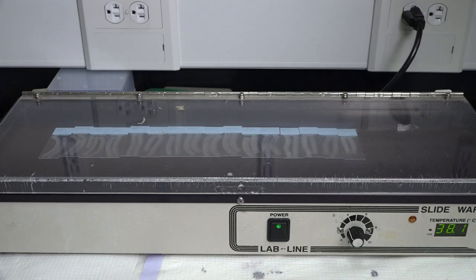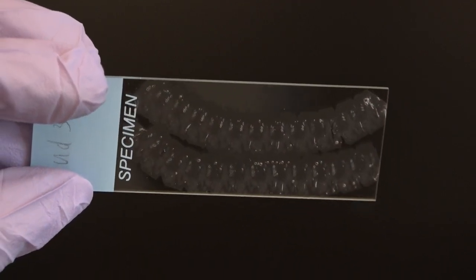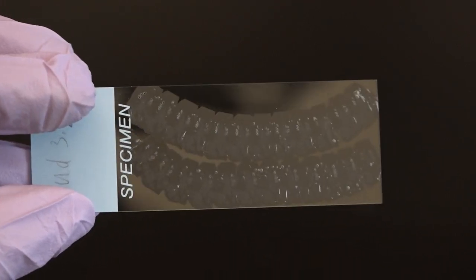Aren't they so pretty? I'll leave them in the slide warmer overnight to dry. The fixation and embedding process tends to remove pigments from tissue, making our sections very difficult to see. So we need to perform one last step to make everything visible again.